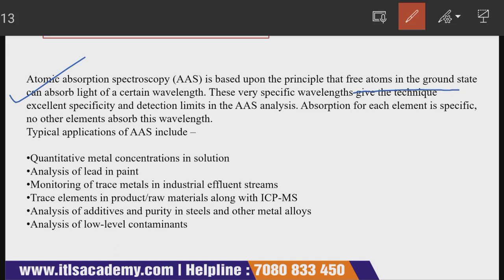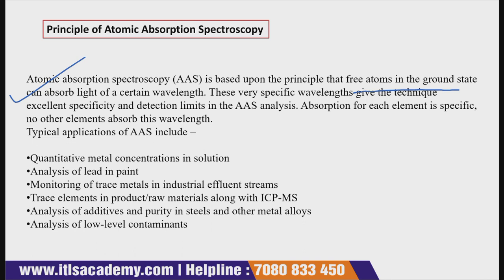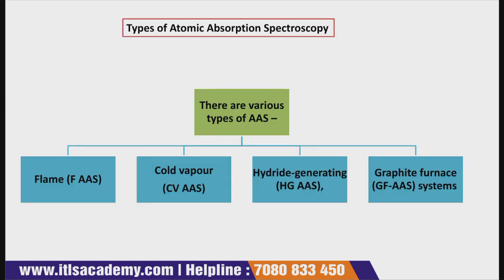So they can monitor trace metals. They are also in huge demand for trace elements in products or raw materials, along with ICP-MS. Analysis of additives and purity in steel and other metal alloys. They have good analysis of low-level contaminants. So they have huge applications at different levels.